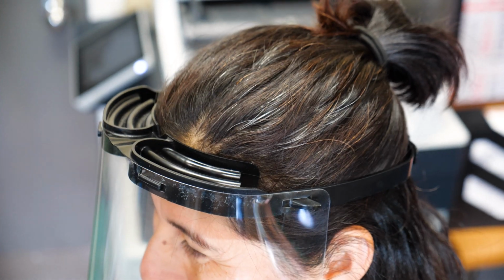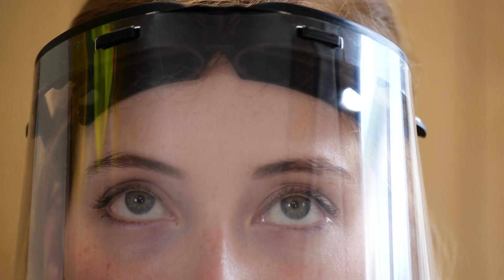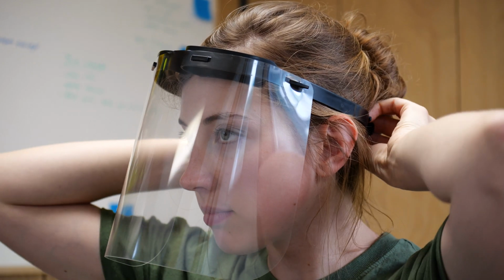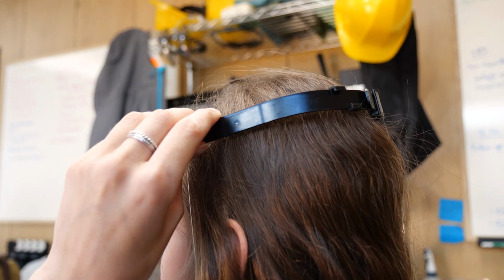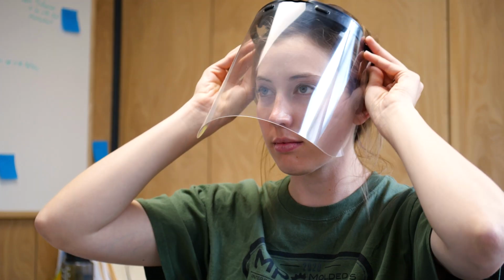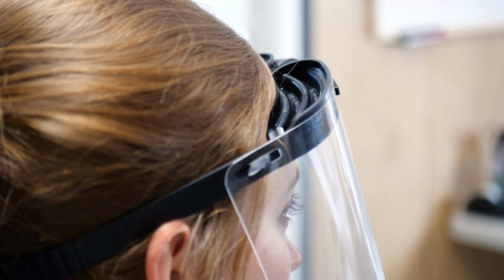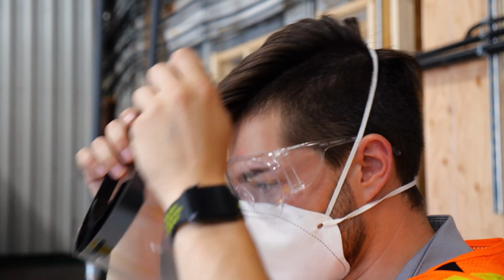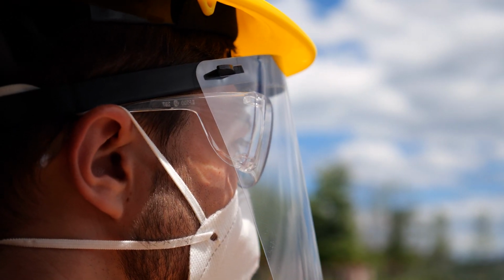Your headband should fit like a baseball cap, positioned approximately 3/4 of an inch above your eyebrows, the strap passing horizontally above your ears to position the adjuster. When correctly fitted, a light pressure will be felt on your forehead and the visor should be parallel to your face. If the strap is too high, the visor will be too close to your face. If the strap is too low, the bottom edge of the visor will be tipped upward and may not provide the necessary protection. In the correct position, there is sufficient space to prevent fogging and allow other personal protective equipment such as N95 masks or safety glasses or regular eyeglasses to be worn underneath.